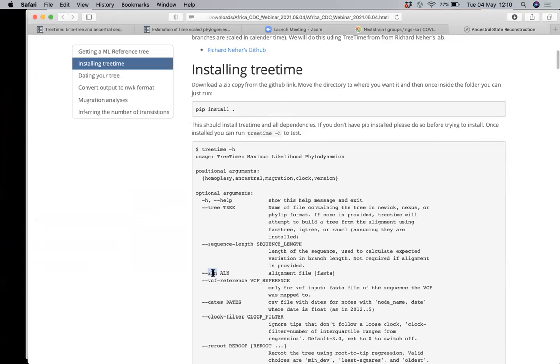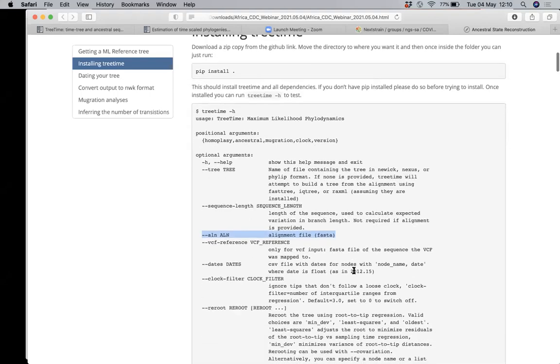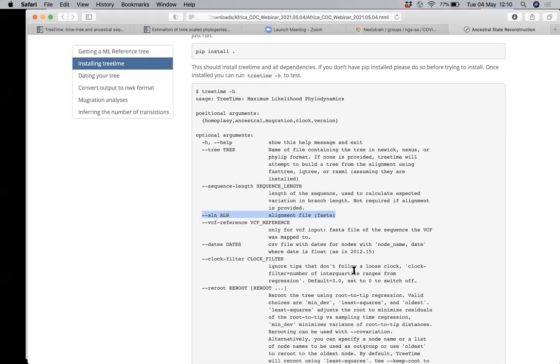Sorry to interrupt, Ed. Is it possible for you to tell us how you arrived at that clock rate, why you chose that one, and where to find them if you didn't have one for a data set? Okay, so this is the known rate at which coronaviruses mutate. So you can find this in the literature.